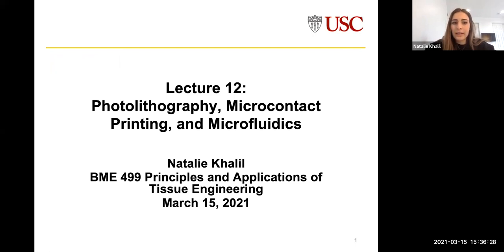And so I'm currently a second year PhD student in biomedical engineering here at USC in Professor Megan McCain's Laboratory for Living Systems Engineering. And today I'll be giving a guest lecture on photolithography, microcontact printing, and microfluidics. These are microfabrication techniques and technologies that we use regularly in our lab, in our research, and that are more broadly used by the field of tissue engineering.